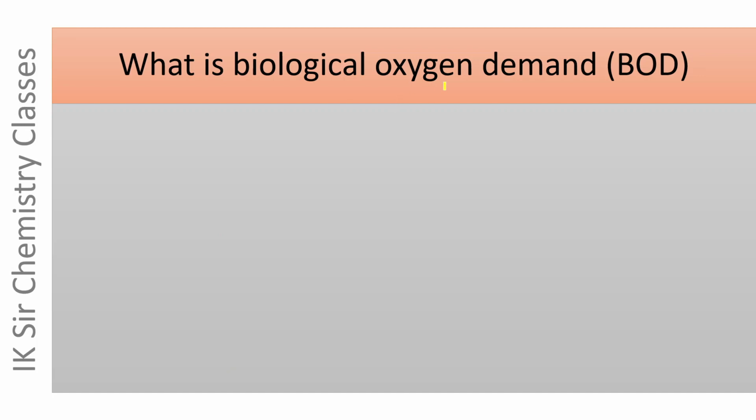What is dissolved oxygen? What is biological oxygen demand? Let us see what is biological oxygen demand, which is abbreviated as BOD.